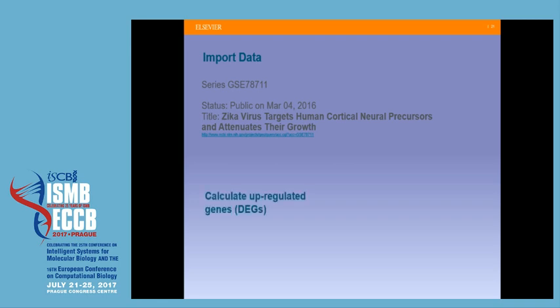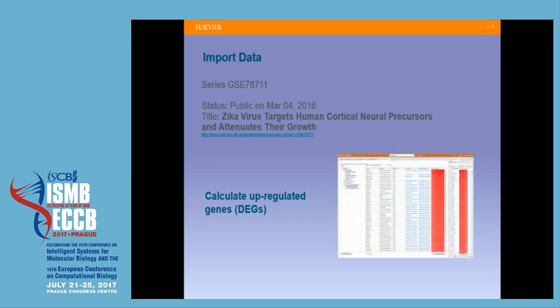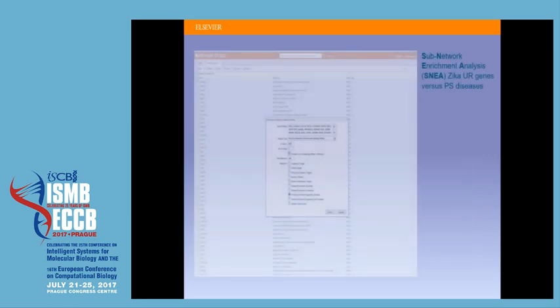So we calculate our upregulated or differentially expressed genes. We basically have 476 of those, as it turns out. And what we then do is what's commonly done as a first step, and that is we simply ask, what is it about this group of genes that's interesting? I'm sure you're all familiar with the idea of enrichment analysis.